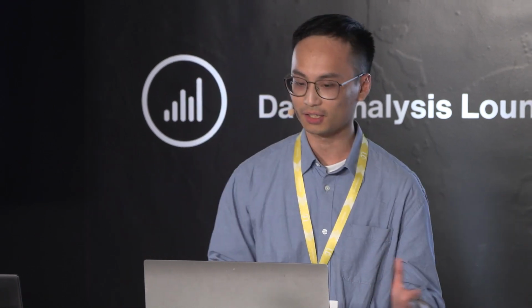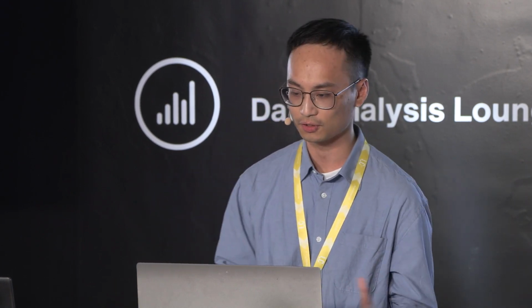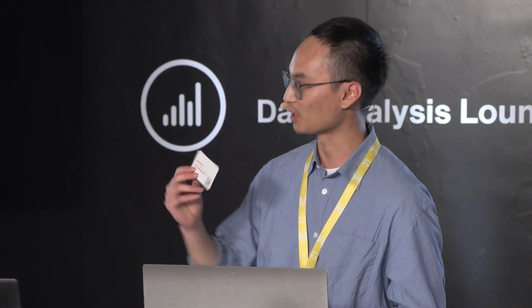Okay, so what we're looking at here is the graphical interface of the application EPI2ME, and I've already gone ahead and imported the workflow into the application. And if you're curious on how to do that exactly, we do have instructions on our GitHub page. I've also created these tiny flashcards that you're welcome to pick up at the very end, which has this QR code that you can scan to find our GitHub page as well.